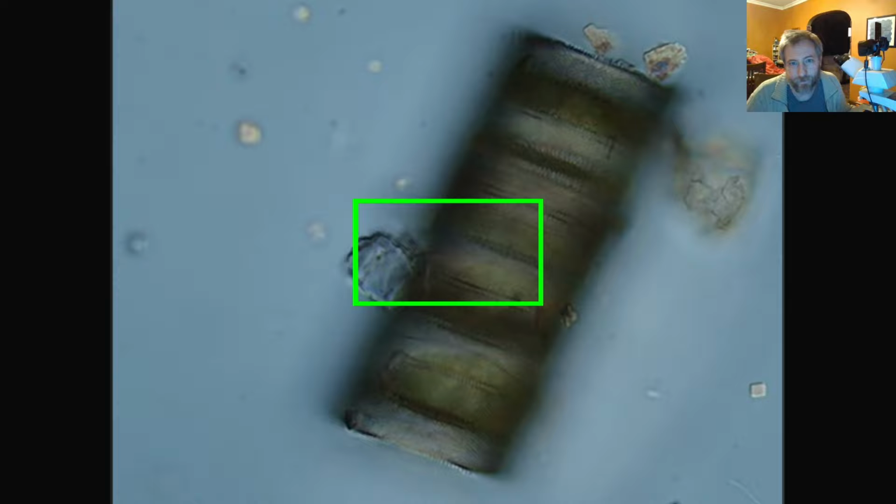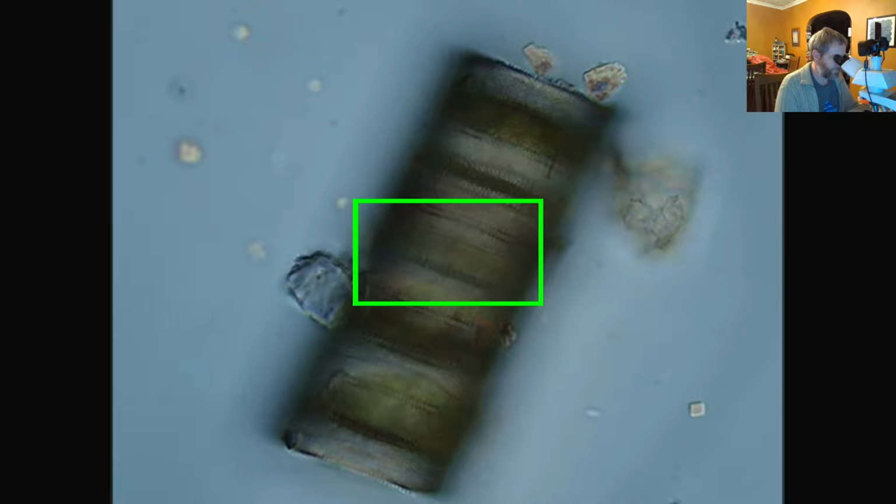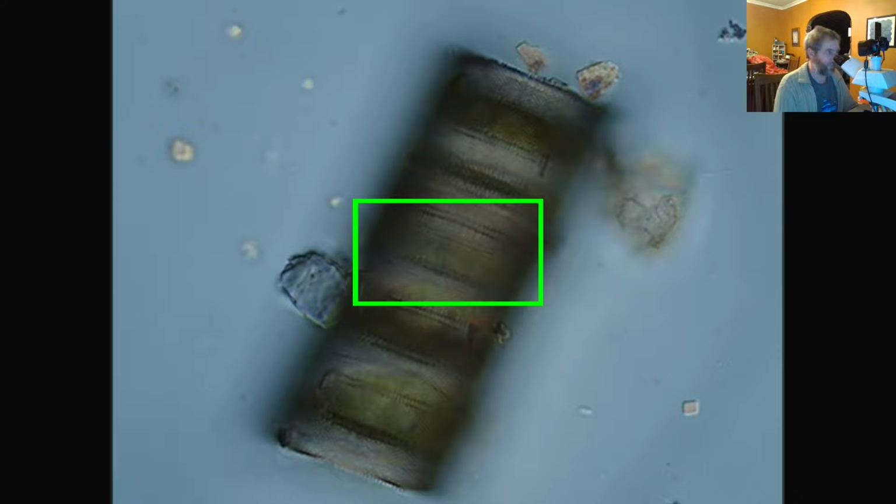Diatom valves there, and they just grow together in these long chains, and then their faces have sort of like a Velcro structure between them. Let's see if I can get up close in one of those sort of Velcro structure type things. In here. By zooming in, there you go. They look like little poker chips, poker chip margins between them. Can you see that at the top up there? There's sort of like a zigzag one way, like a zipper. They kind of zipper together. And so that's the separation between one diatom and the next along that zippered interface.